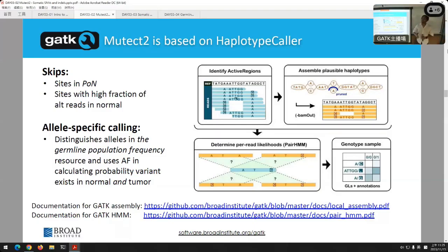Sorry, if that didn't answer your question, feel free to come up afterwards. Sorry, you have a question? That's a really good question. Do we have to separate by gender? The main difference we'd see is, of course, a Y, and there are different copies of the X. For the copy numbers, you'll see you have to separate. Okay, right. So for some, yes, for copy number, yes.